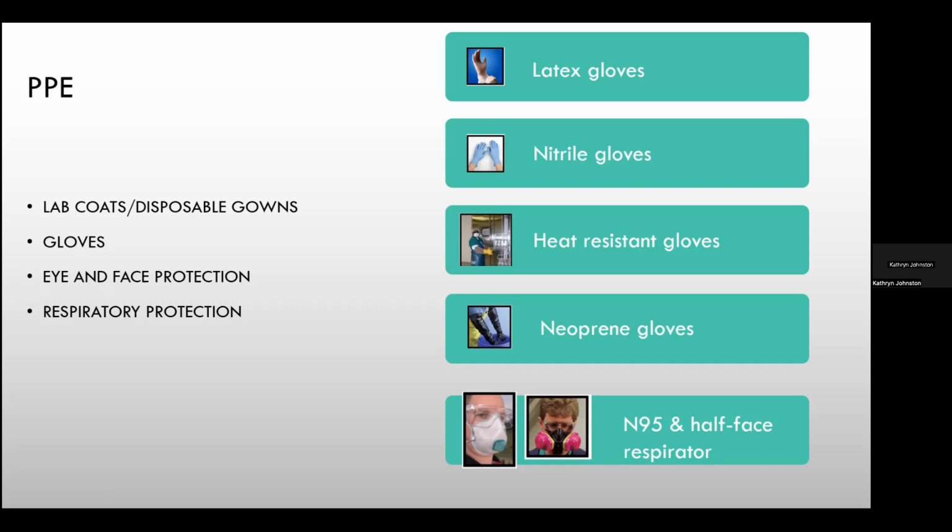It can prevent the spread of contamination outside the lab, provided that your gowns aren't worn outside the lab. And each supervisor is responsible for ensuring that his or her workers, employees, students, and if applicable visitors, use the appropriate lab coat while they're working in there.